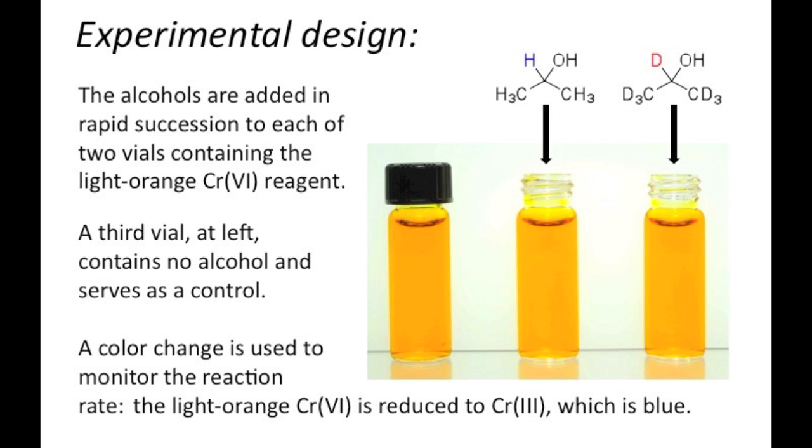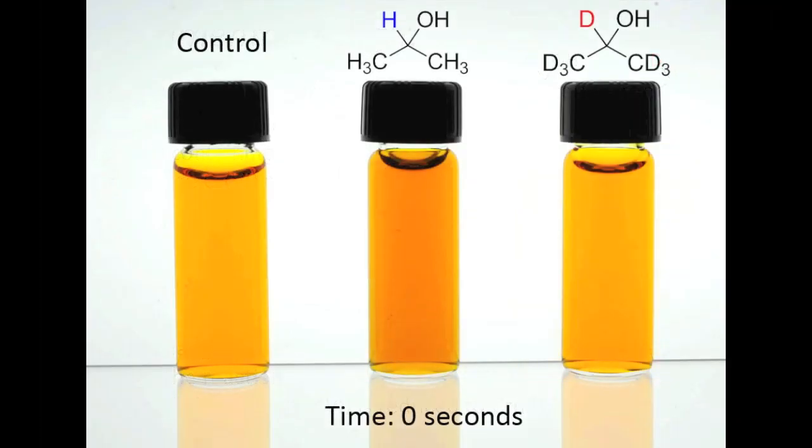On the next slide, you will be able to see that chromium-6 has begun to react with the alcohols. This first shot was taken approximately 30 seconds after the reactions began. Therefore, 0 seconds is when the photo started, but not the reaction. Here is the first shot of the experiment at approximately 30 seconds after the reactions began. We ran the experiment for 90 minutes and took a photo of the vials every 10 seconds to document the reactions.